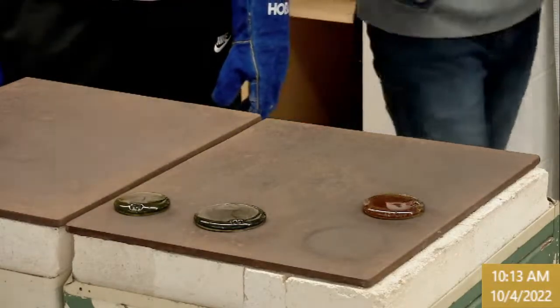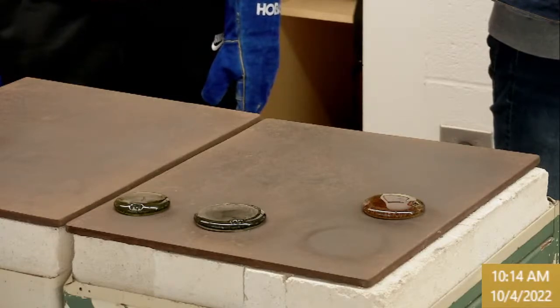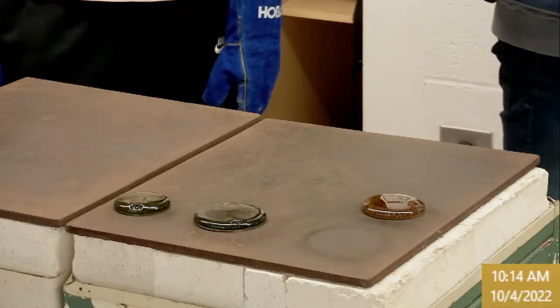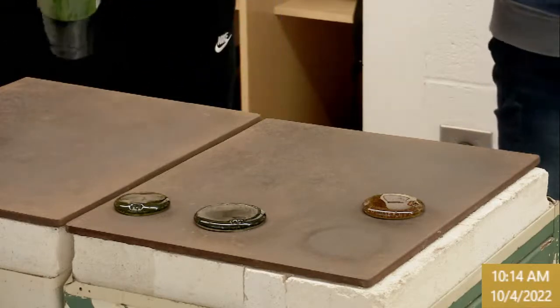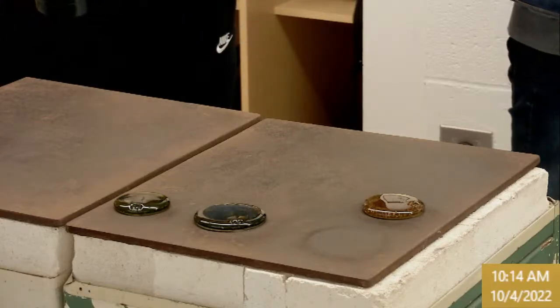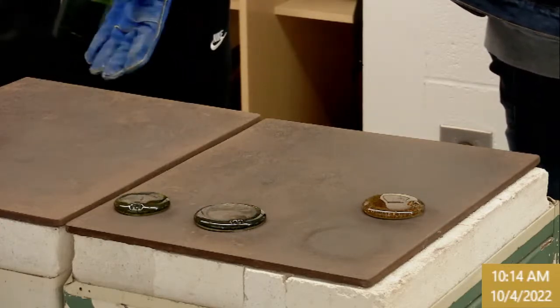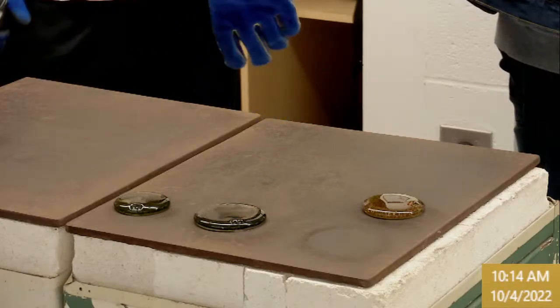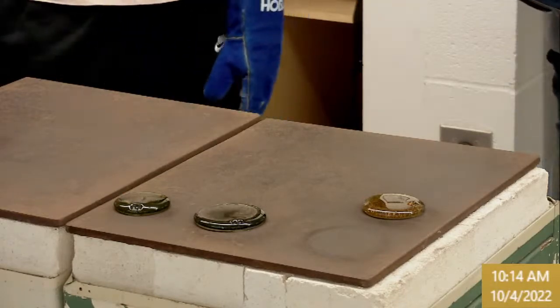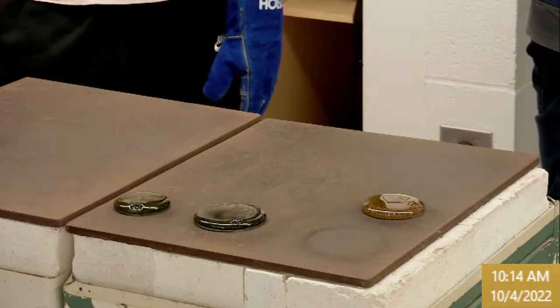And the next batch is E2. We'll pour from the right. E2: Mason sand, washing soda, crushed limestone. Is that it? No colorant? Does that sound normal? Okay, so this is going to be the native color, and this one's going to be kind of cool because this is going to have some color because of the Mason sand, but this is going to be all native color from the raw mineral. So this will be kind of neat. This is an impure sand and an impure limestone. So it's iron plus mystery mineral from the sand. So E2.